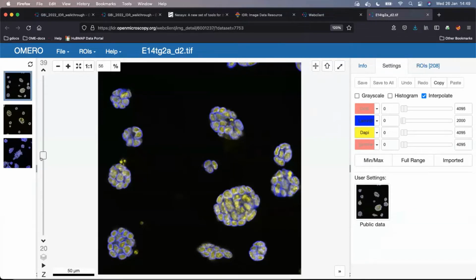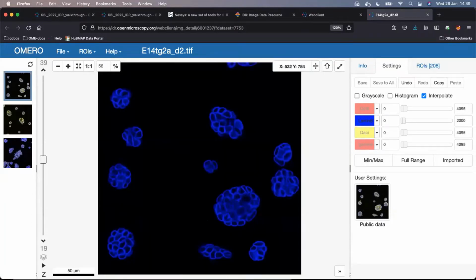I choose to do so, and I have here, of course, a slider. You can recognize the Omero iViewer, which was presented yesterday in the workshop, and can go through the set sections, etc. And I can switch on and off channels if I wish so, such as I can switch off the yellow channel because I know that it interferes with nice viewing of the regions of interest.